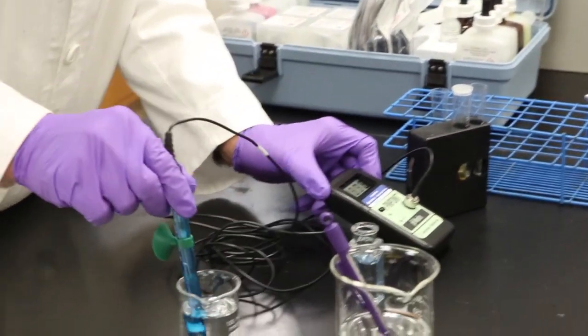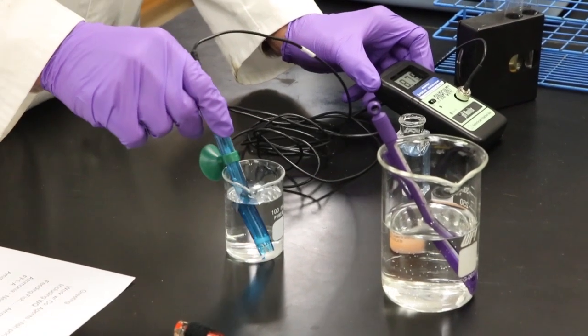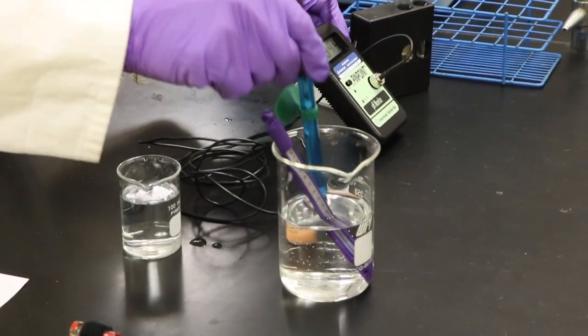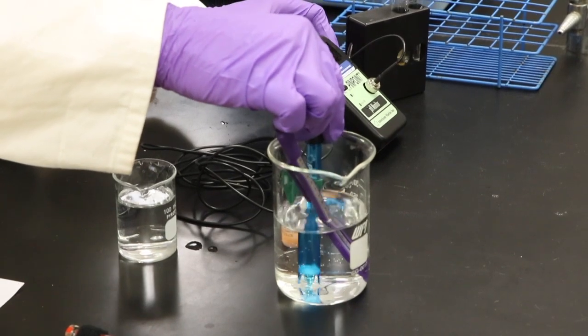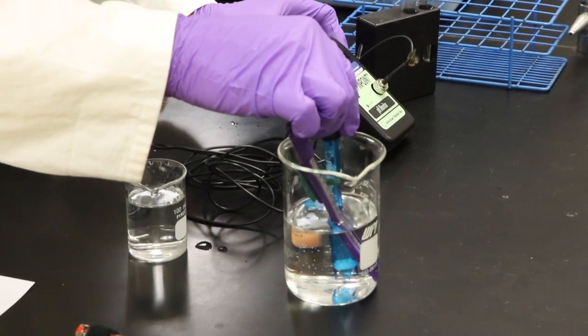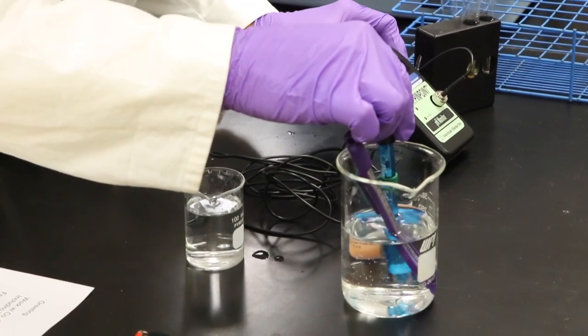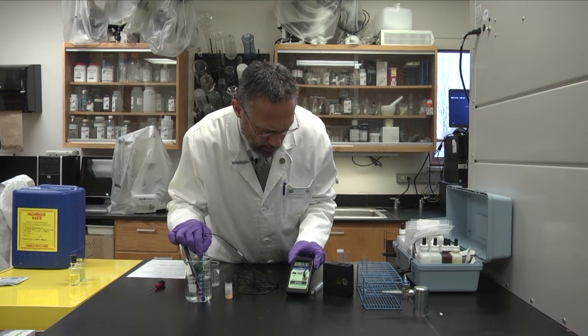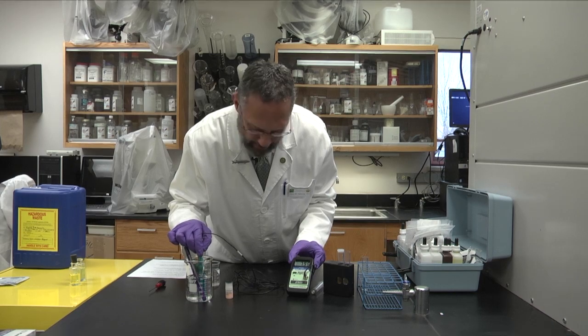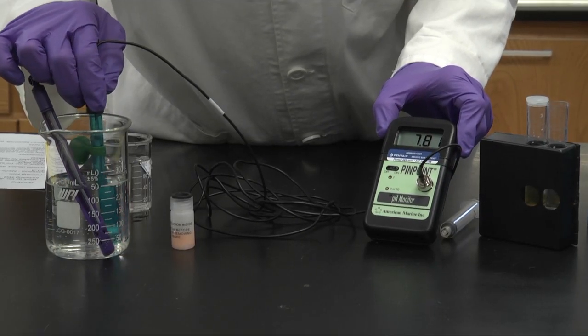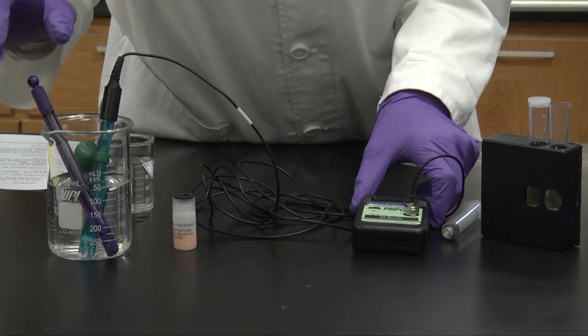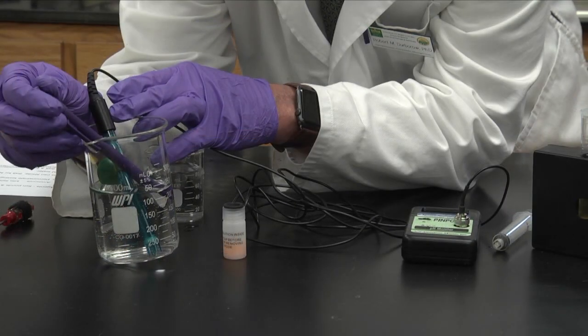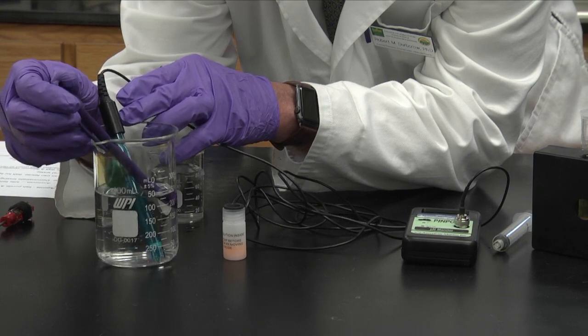Now since it's calibrated I'll rinse the probe off again. I'll set this aside here and I'll put the probe into the solution, into the tank water solution that I'm interested in checking the pH for, and you see the pH is approximately 8.1. Looks like it's dropping down a little bit to 7.97. Okay so 7.8 is the rough pH of this solution and the temperature is 18 degrees centigrade, 18 degrees C.